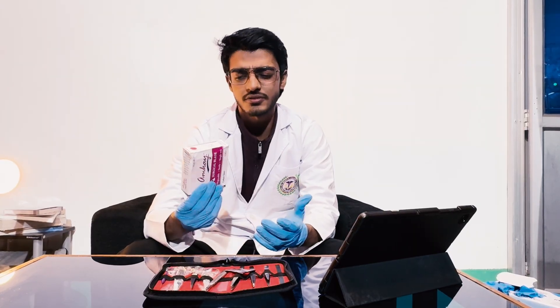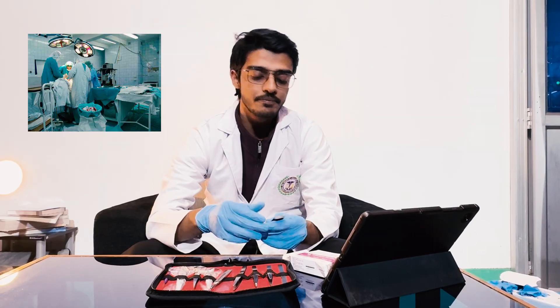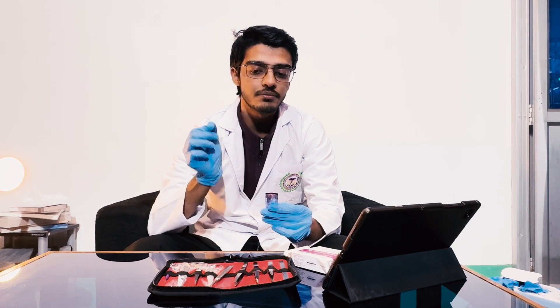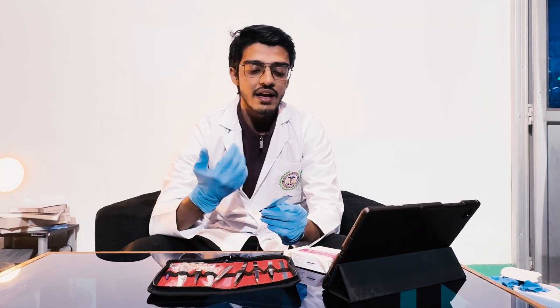Usually two or three blades come with your dissection kit, but I suggest you buy the whole blade box — I believe it contains 100 pieces and costs around 250 rupees. Many people say two or three blades are enough, but the reason for having more is precision. When you cut layers of skin or muscle, you need accurate precision to not cut too deep or too light. Using a blade continuously for two or three days may make it blunt, and that's not what you want.